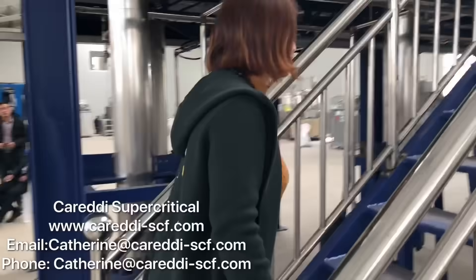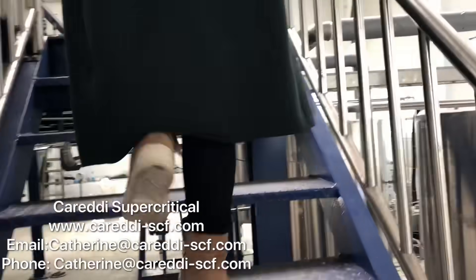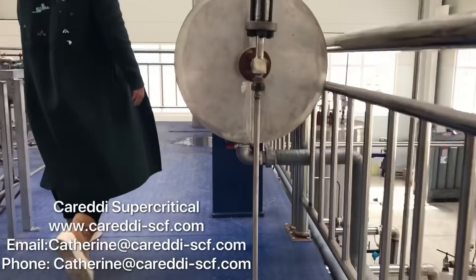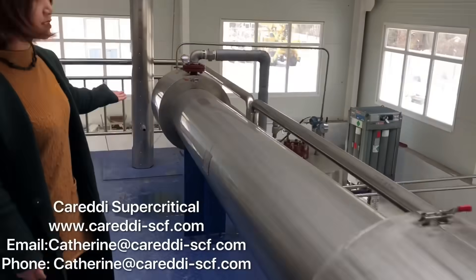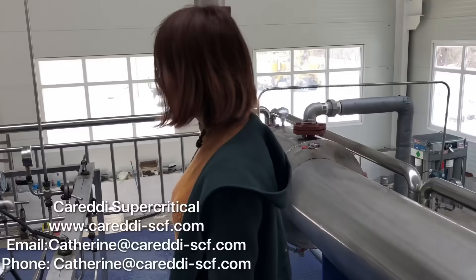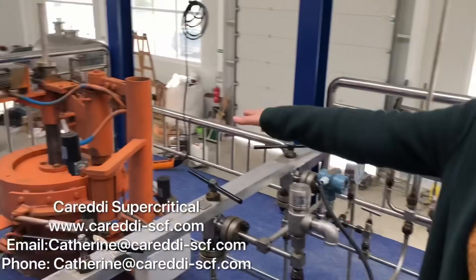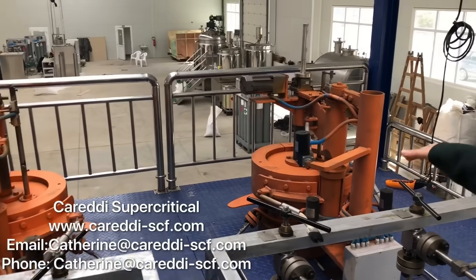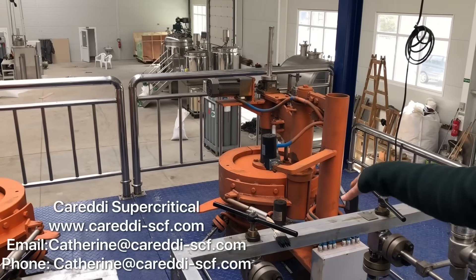Now let's go to have a look upstairs. This is the filter valves and the condenser for cooling the CO2. These three are quick-open structures for the extractor covers, which open and close automatically.